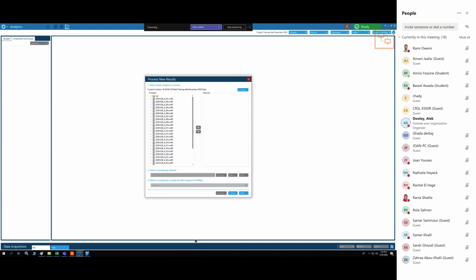Okay. So now we did this very quickly, so I didn't add my names. So I need to find the IDA. All right, so you said everything with a B is a spike, is that correct?